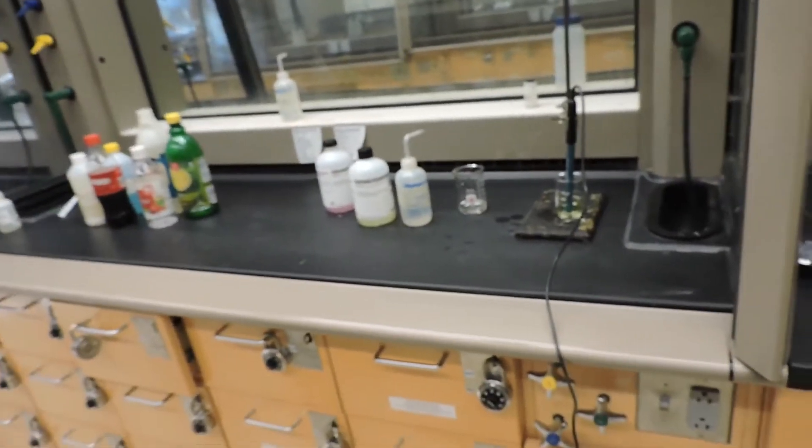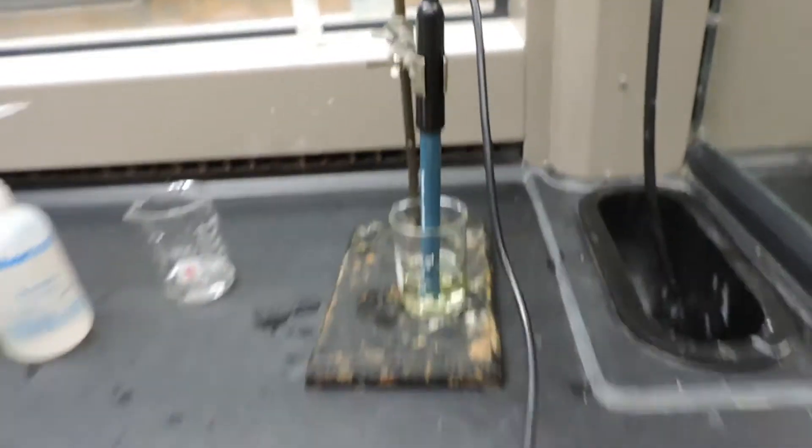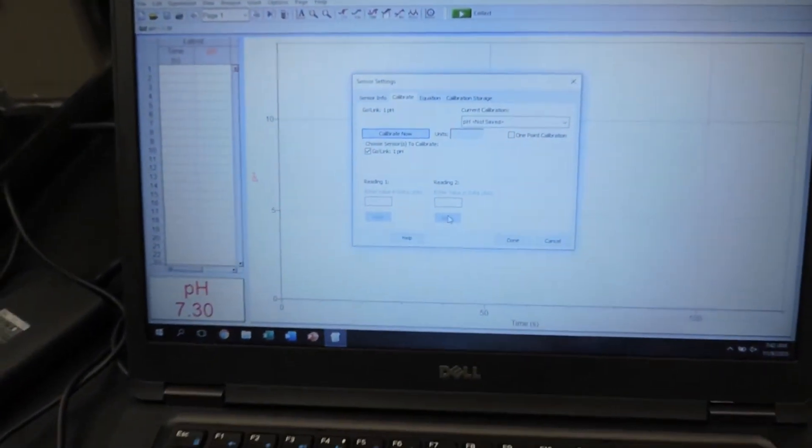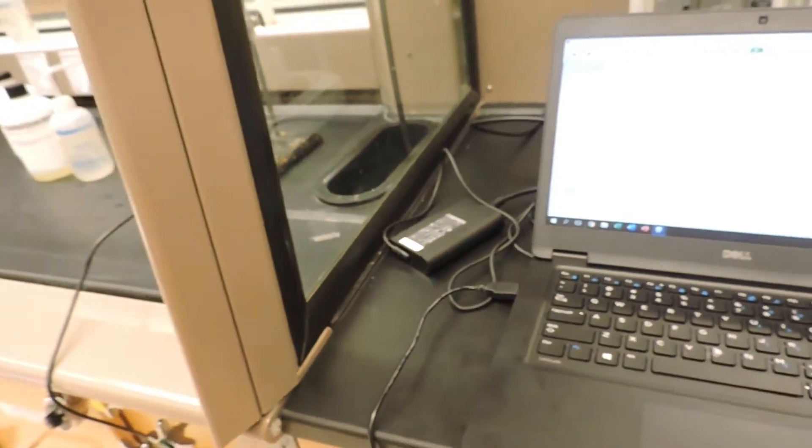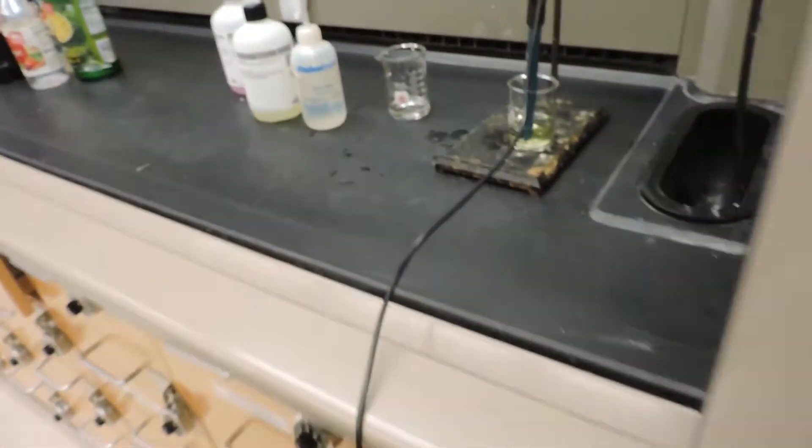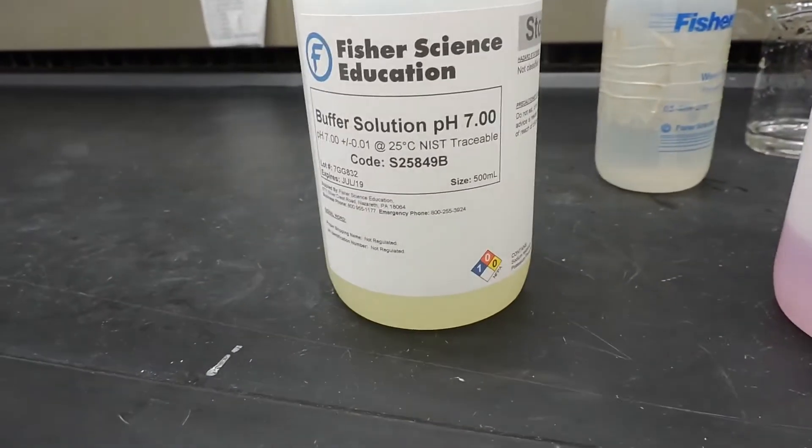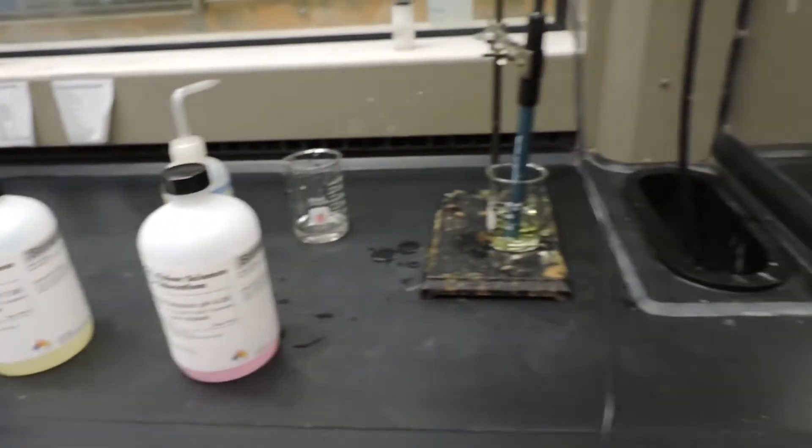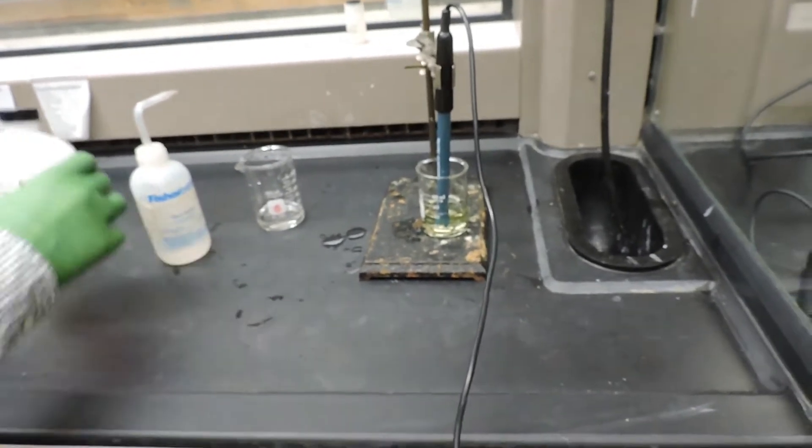First we're going to calibrate the pH meter. This is the pH meter here, connected to the Logger Pro software on this desktop, so that's how we'll be reading the pH for today. We're going to calibrate our probe using a two-point calibration. We have two solutions, a pH 4 and a pH 7. We're going to immerse the probe in those solutions and calibrate them according to what the pH should be.